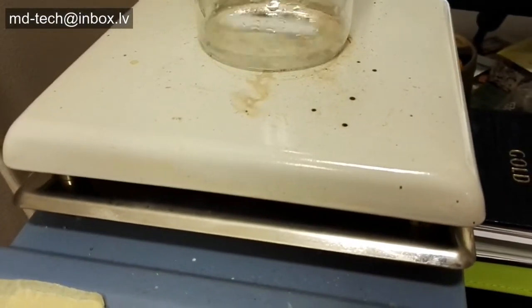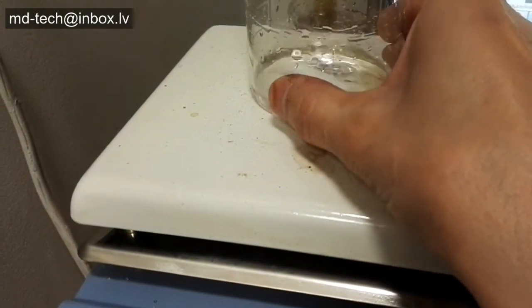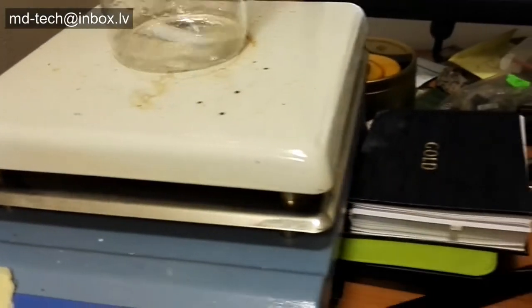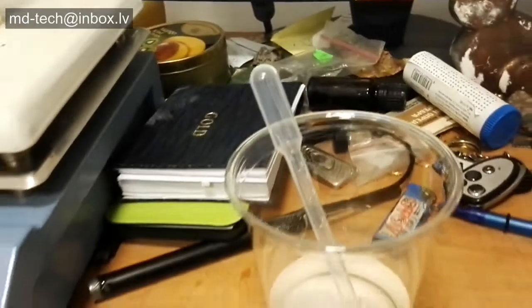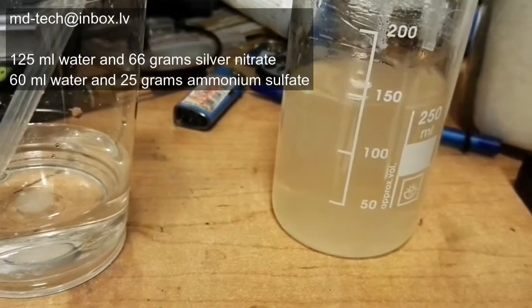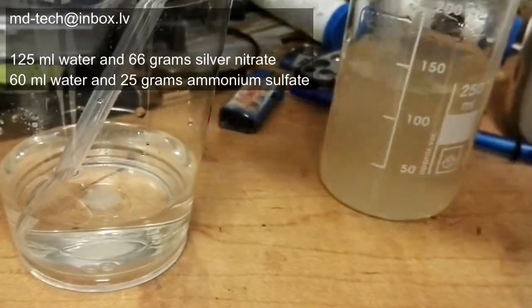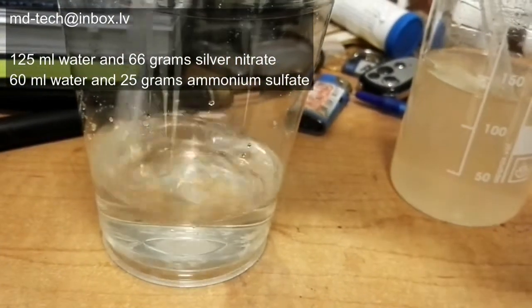I place beaker on magnetic stirrer and add 6 grams ammonium sulfate and 14 milliliters water. In two beakers I made solution of silver nitrate and solution of ammonium sulfate.